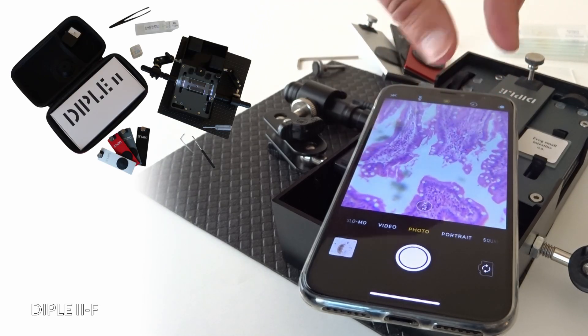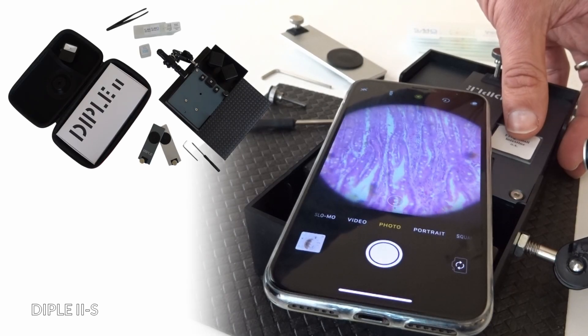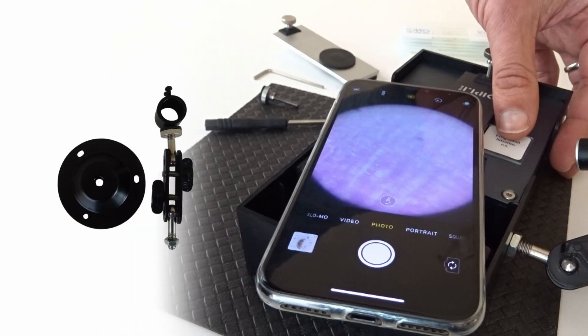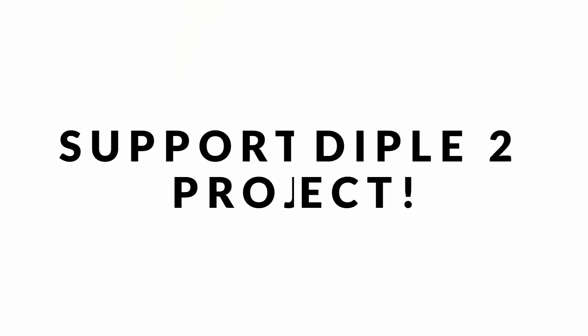Two kits are available. Dipple 2F: the most complete kit. Or Dipple 2S: the most affordable kit. You can decide to upgrade your Dipple 2S according to your needs at a later time too. Support the Dipple 2 project — be among the first to get this new generation of optical tools.